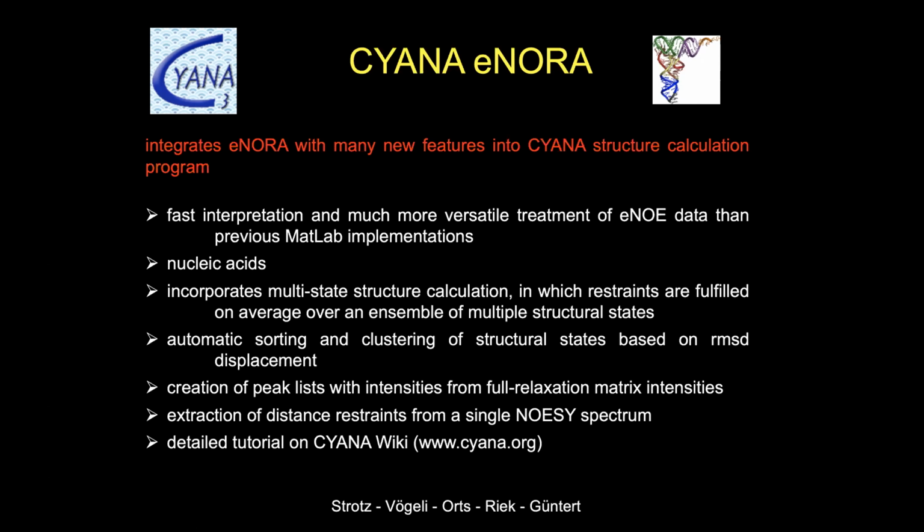If you take your maybe 20 best structures, you want to figure out if your two states are random or not. If they're not random, then each result should produce the same two states. For example, every run would give you this blue and cyan state. We used to do that manually, just figuring out whether this is the case or not. But now you can just do that based on RMSD considerations.